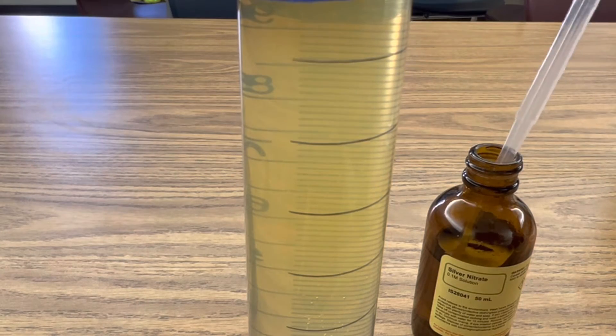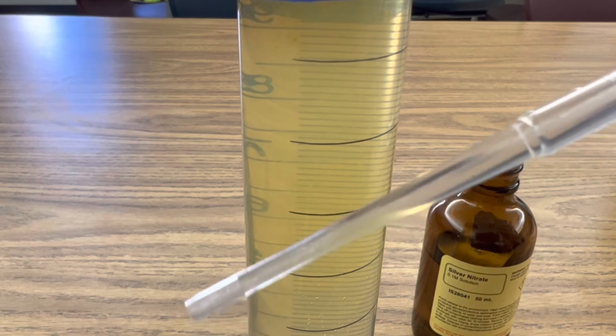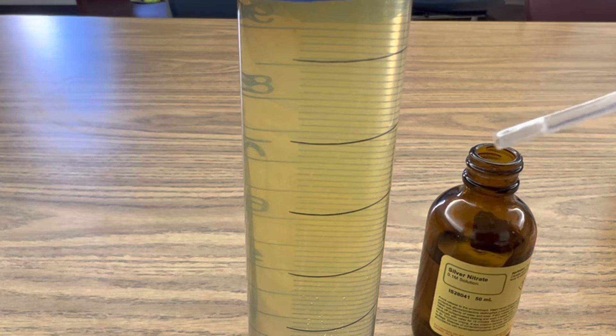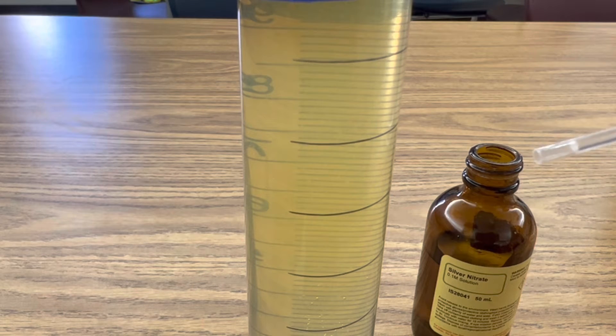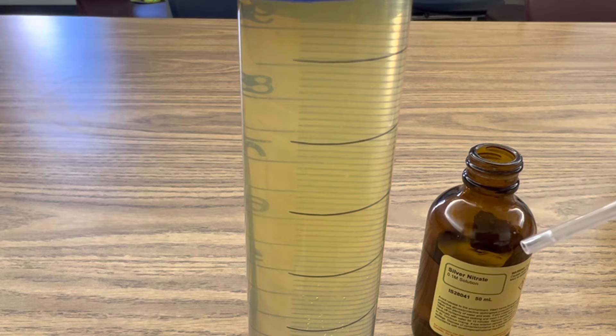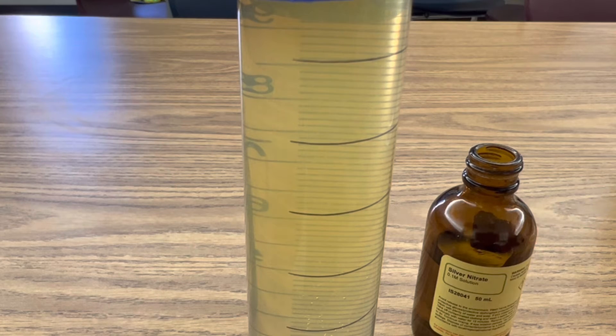So now I'm going to add drops of silver nitrate, and you can see that it's clear, to my aqueous solution of iron sulfate. And when I do that, this is a double displacement reaction where the metal ions trade places and the silver nitrate will create the precipitate of silver sulfate. So let's see what that looks like.